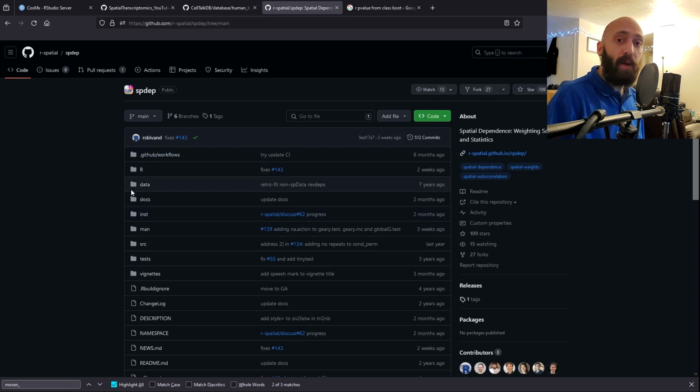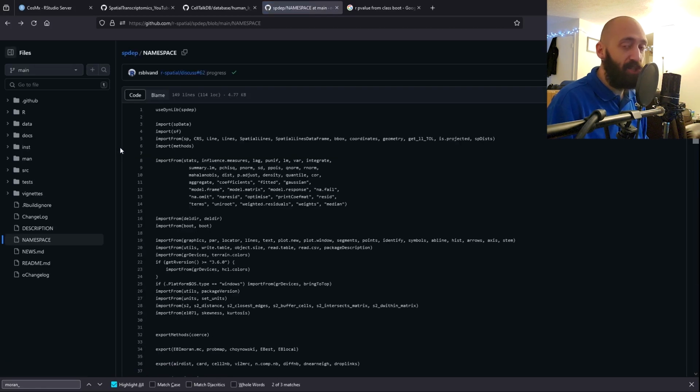So this isn't a point pattern anymore; we're looking at continuous data. Are the regions on the sample with high expression of one gene also the regions with high expression of the other gene? That's going to be a proxy, looking at gene expression, for whether or not there is protein for the ligand and protein for the receptor that potentially are talking to each other.